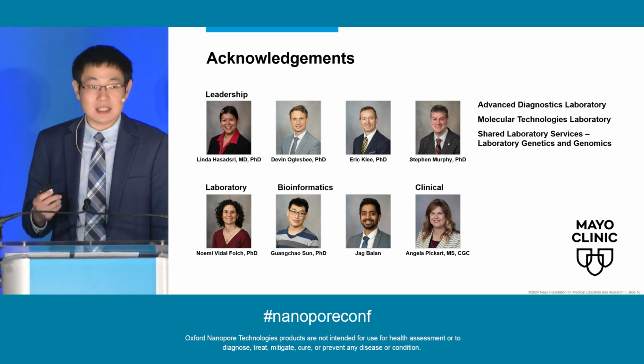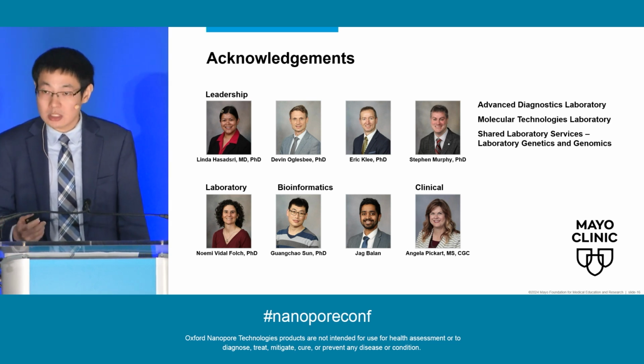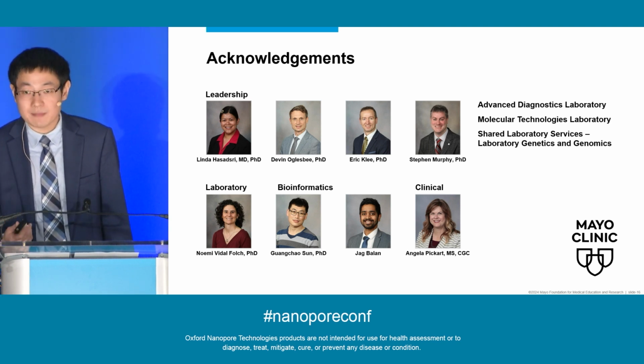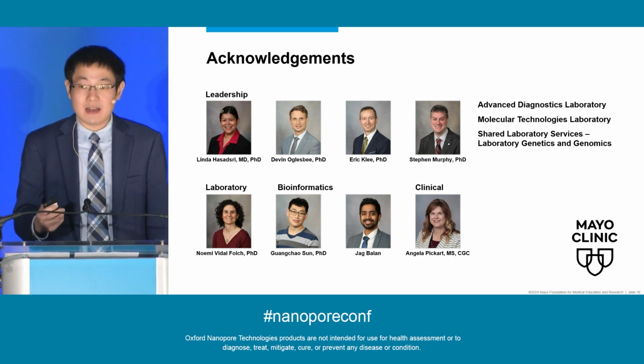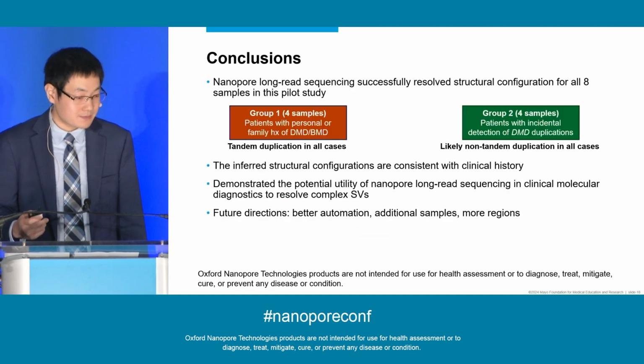We're interested in the DMD region because the DMD gene is one of the largest genes in the human genome, and therefore, by chance, there are more intragenic duplications involving this gene. However, the methodologies we developed from this study are equally applicable to other clinically relevant genes.